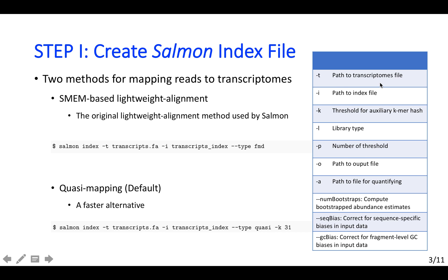Here, t identifies the path to the transcriptome files, i is the path to the index file, while k is the threshold for the auxiliary k-mer hash.